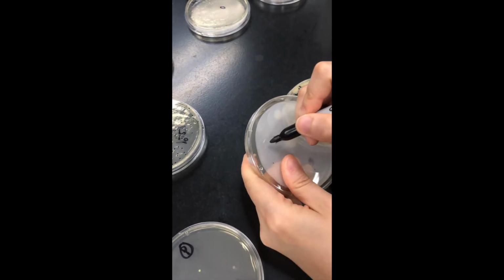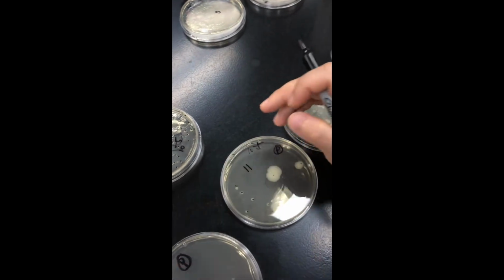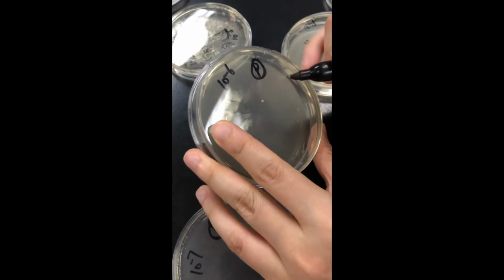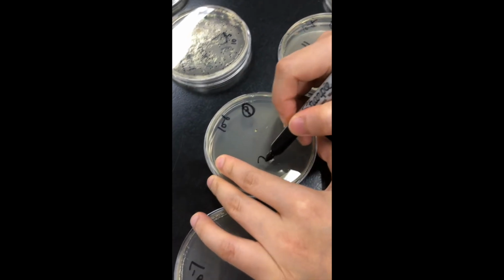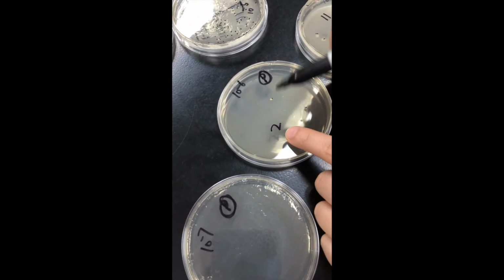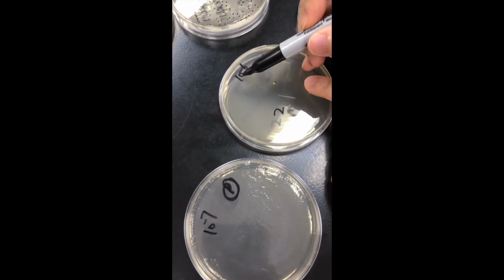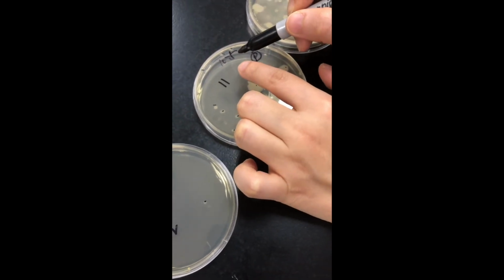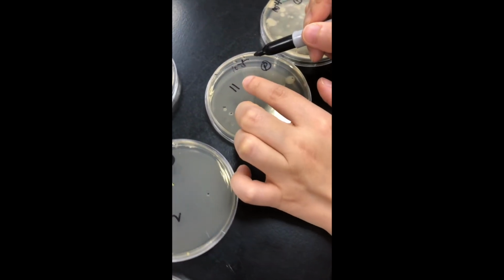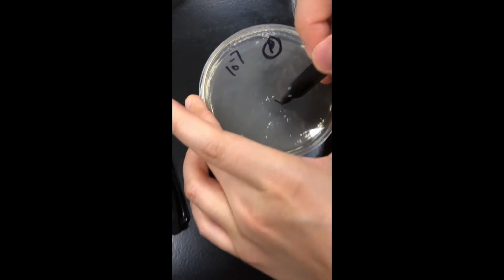Since this is less than 30, I won't use this plate, and the 10 to the minus 6 has only 2. I won't use this plate either, but you need to input this number into your table for your 10 to the minus 6 plate. This number you also need to input into your pasteurized raw milk table for the 10 to the minus 5 plate. For the 10 to the minus 7 plate, here 0.